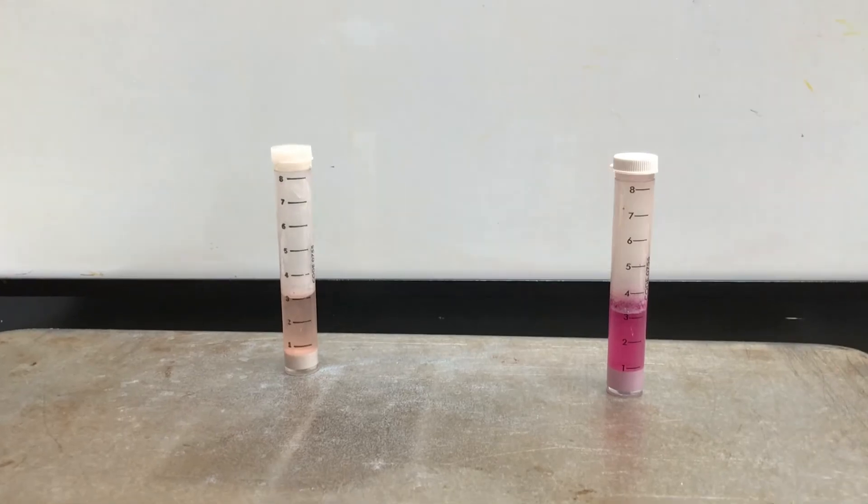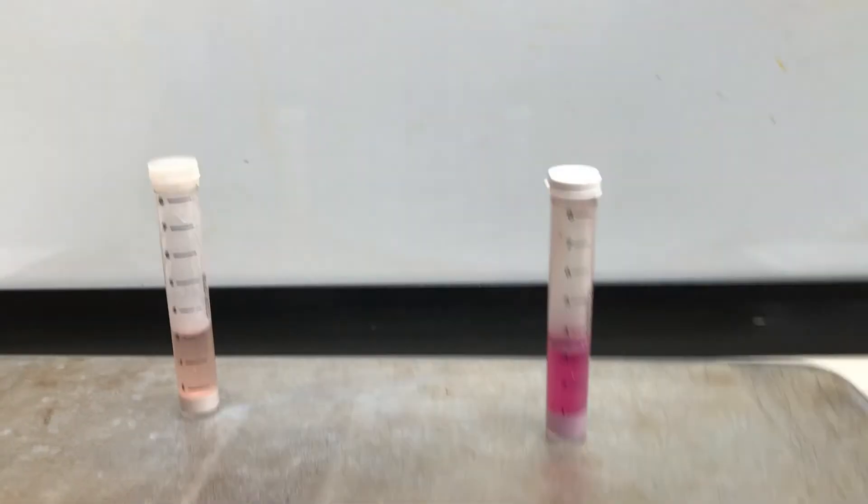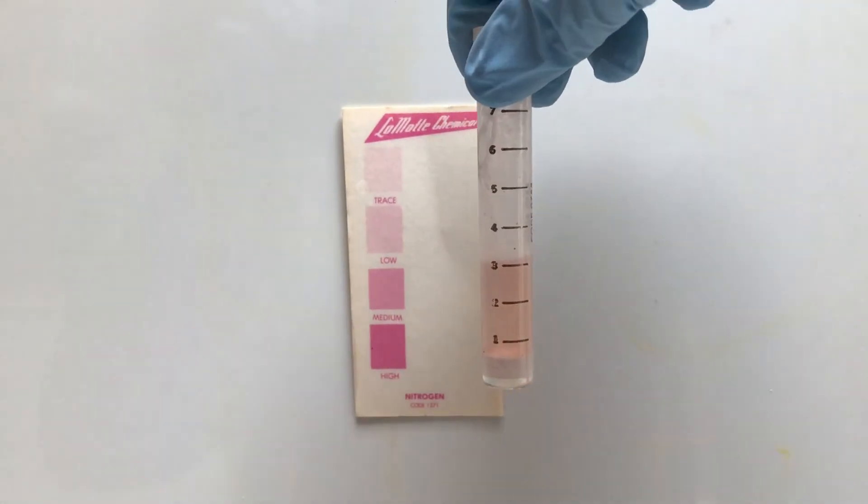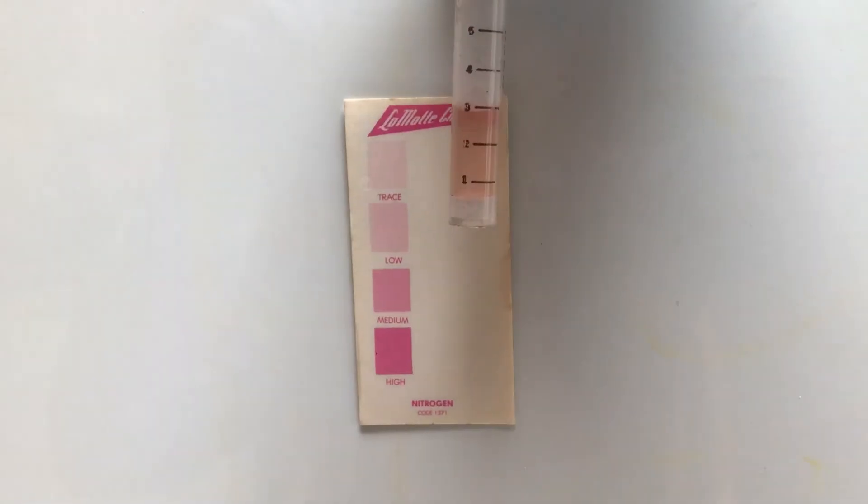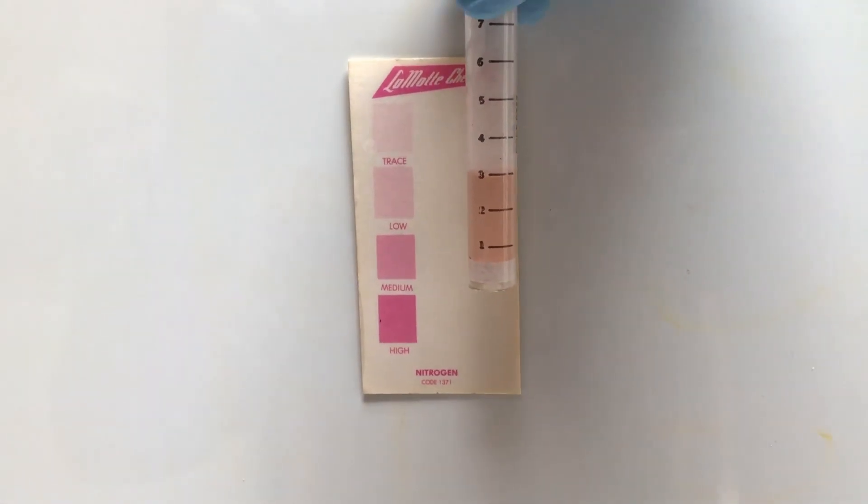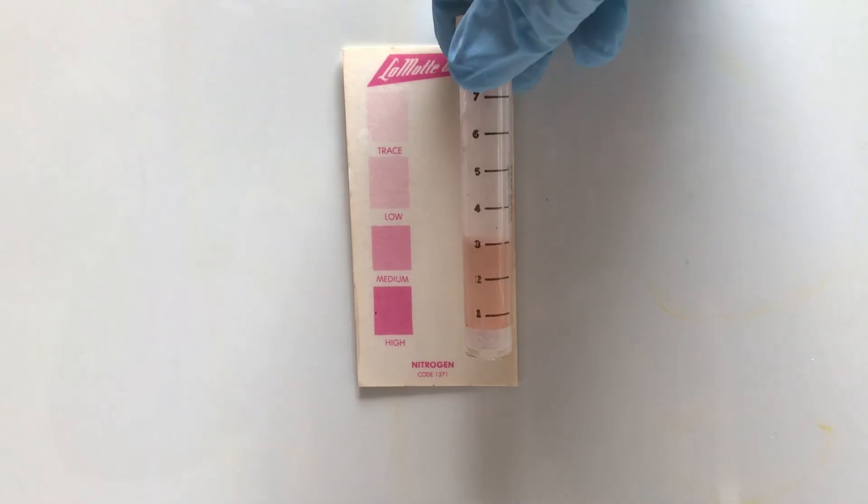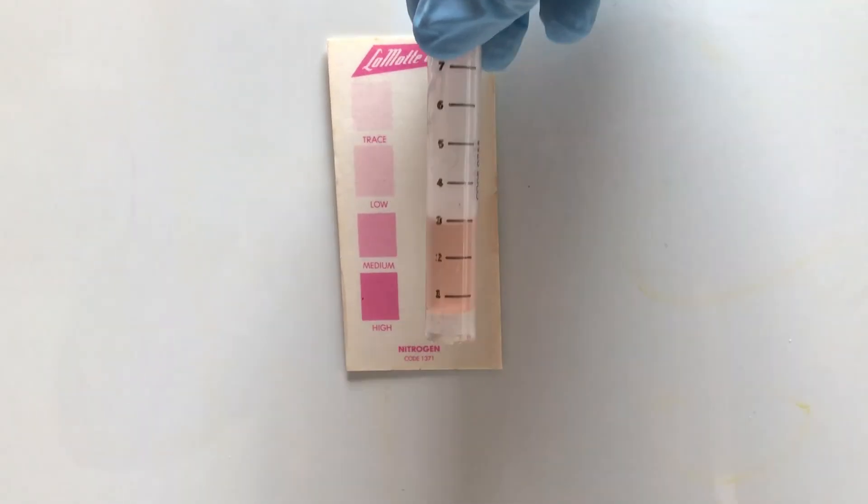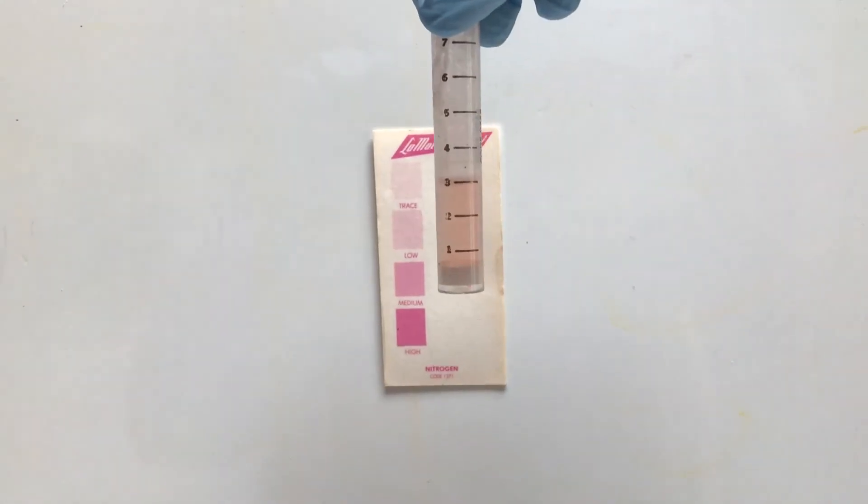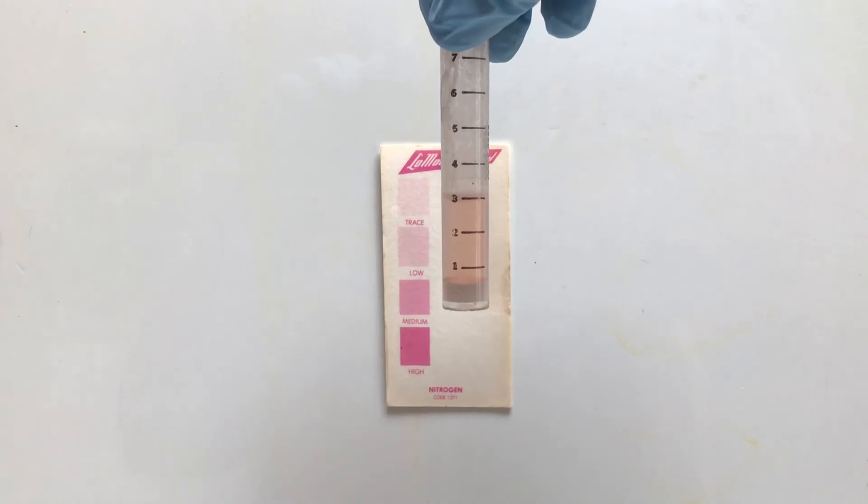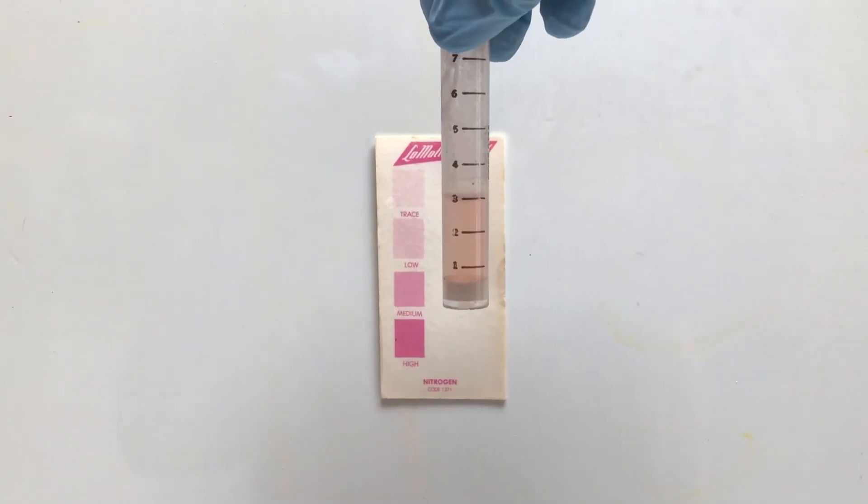So what does this mean? Well we have to check it out against our key, so let's start with our crime scene sample. If you look at the colors, you'll see that trace is almost no color at all, low is kind of a light pink, medium is a darker pink, and then high is that hot pink color. Based on the colors, I'd say this would probably be a low level of nitrogen in our crime scene sample.